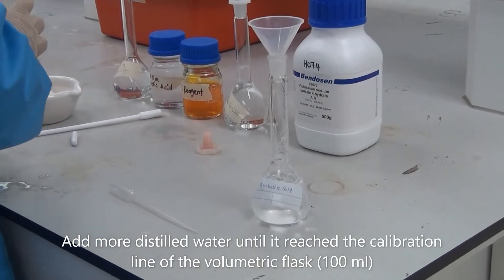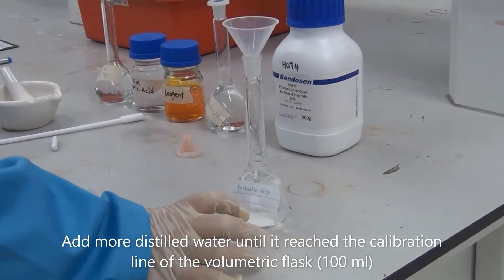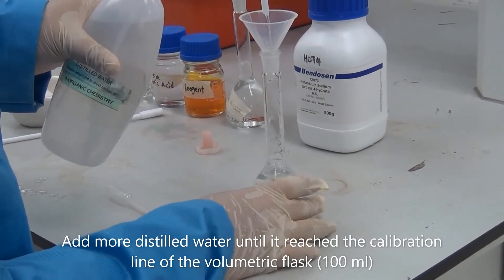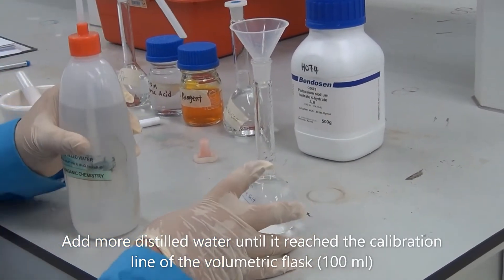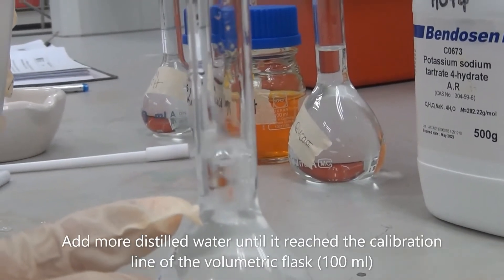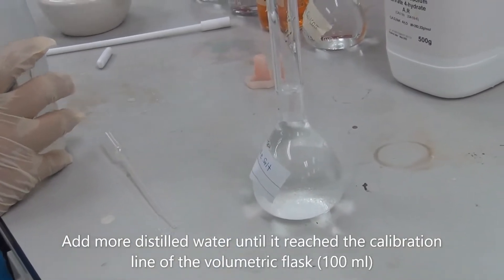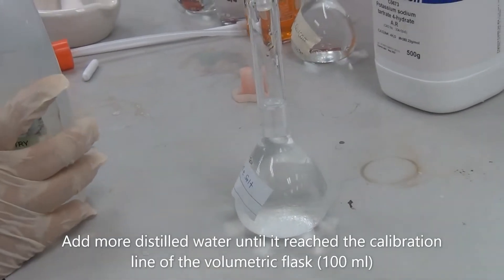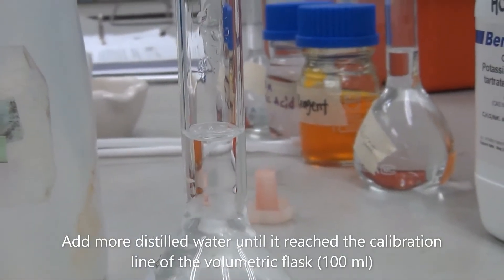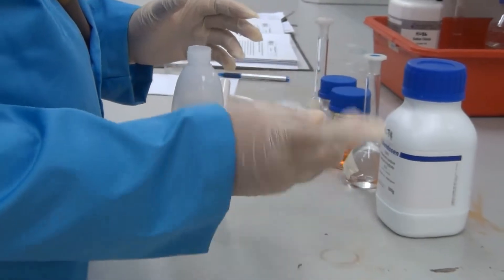So this is 50g. And then we top up with distilled water until the mark, and then we mix the solution until fully dissolved.